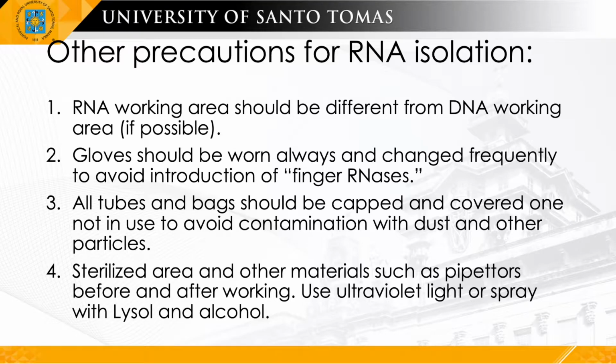So number three, all tubes and bags should be capped and covered when not in use to avoid contamination with dust and other particles. Sterilize the area and other materials such as your pipettors before and after working. Use UV light or spray with Lysol and alcohol.